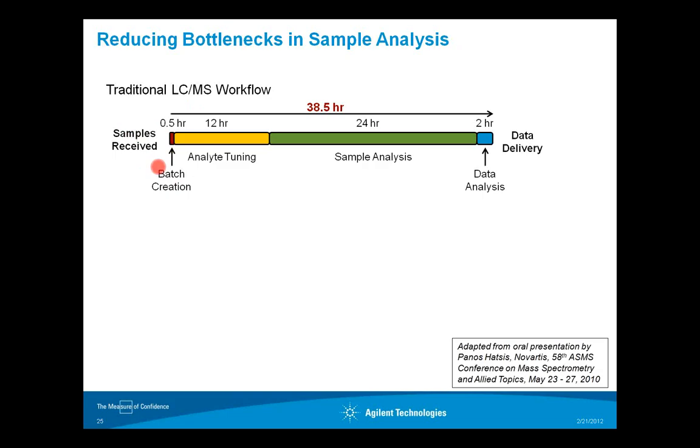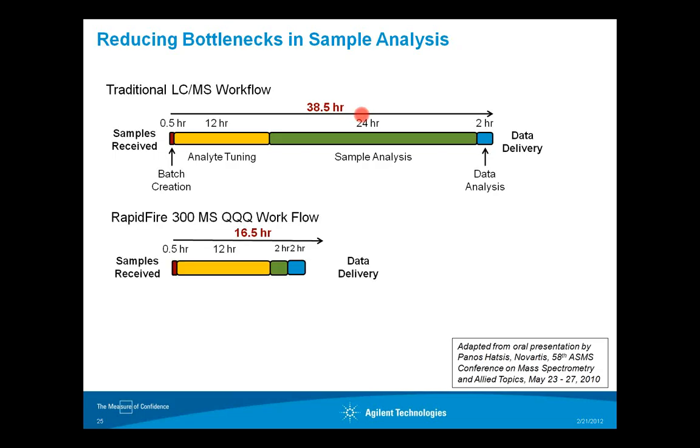They would receive their samples from medicinal chemists on Monday. They do tuning of the analyte, sample analysis by LCMS, and deliver the data about 38.5 hours later, or after approximately a week of work. They would deliver the data back to the medicinal chemist, and they could be ready to go on to the next round of developing this target molecule.